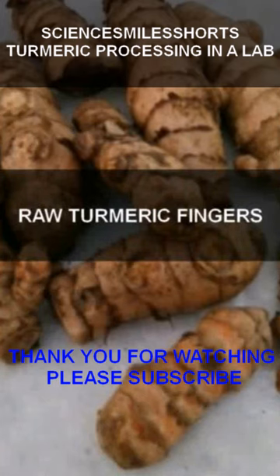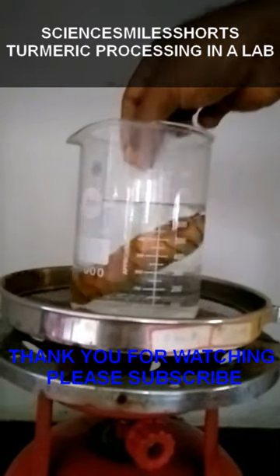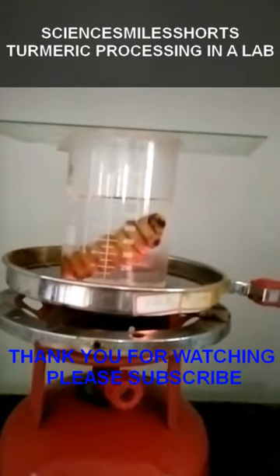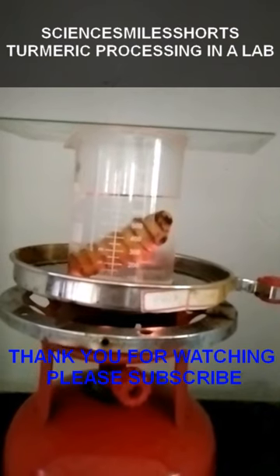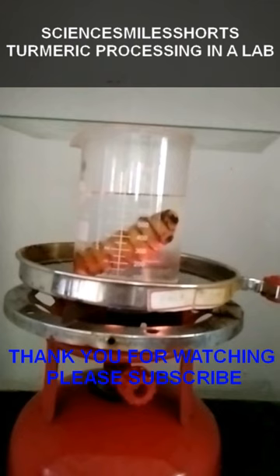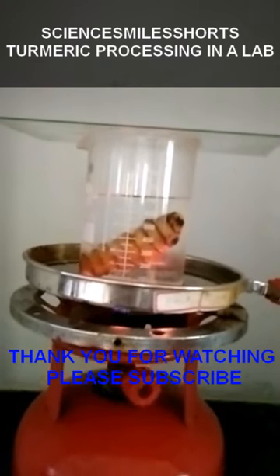This video shows the boiling process of turmeric in the laboratory. We have taken a single turmeric finger as an example, boiled it, and have shown the outcome of the process.